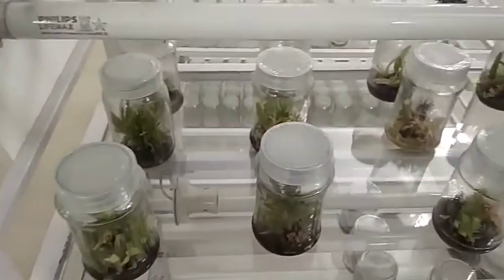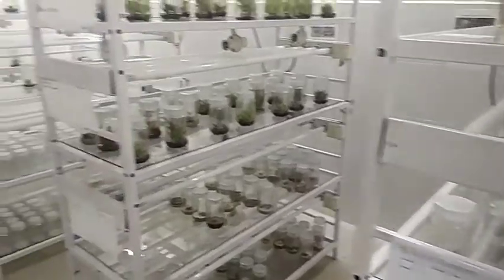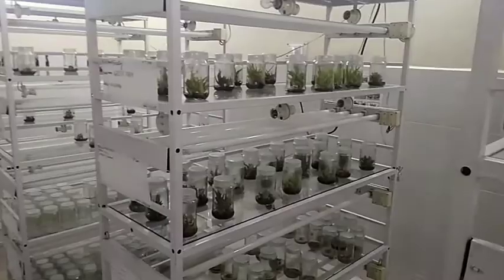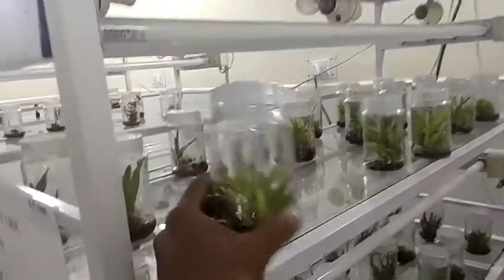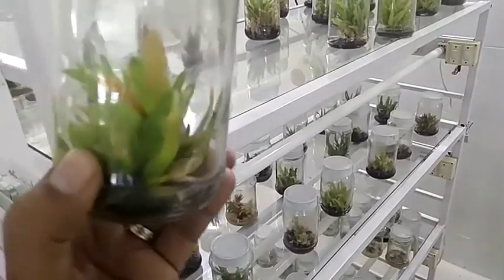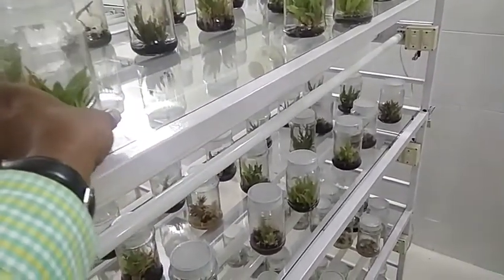You can keep it in the hardening area for the growth of the plants. In tissue culture, you can raise thousands of plants in a very small area. It is a somewhat expensive method, but you can grow plants true to the mother type. This is an aloe vera plant — thank you.